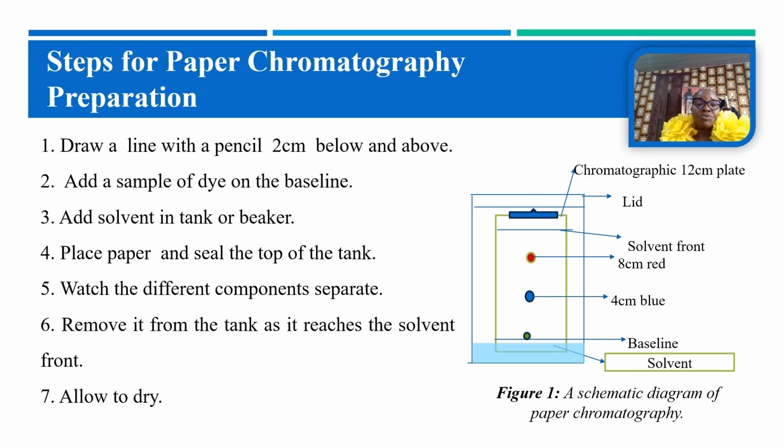As you allow it to dry, you will be able to see the spots, or if you don't see them, you can use developers to identify your chromatogram.